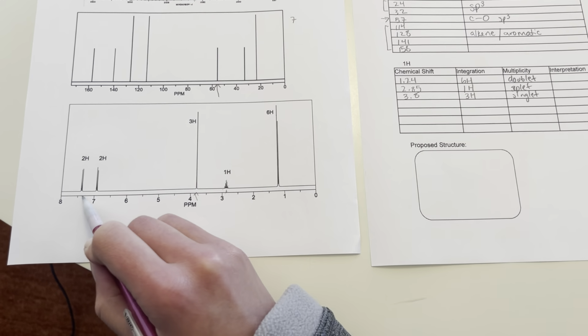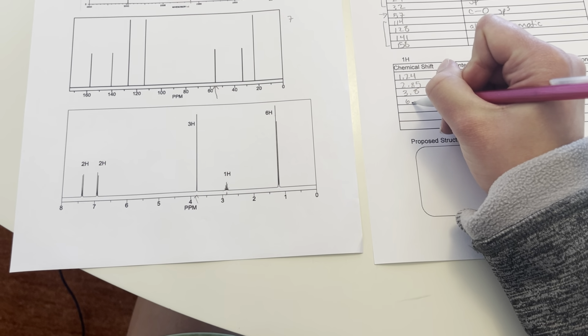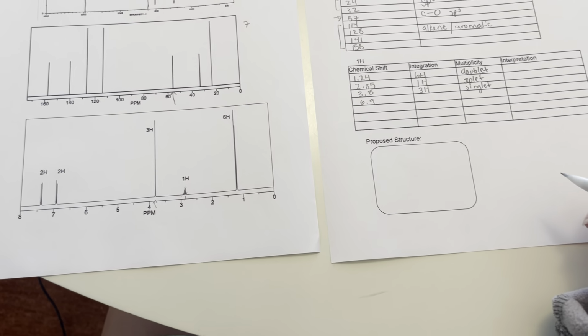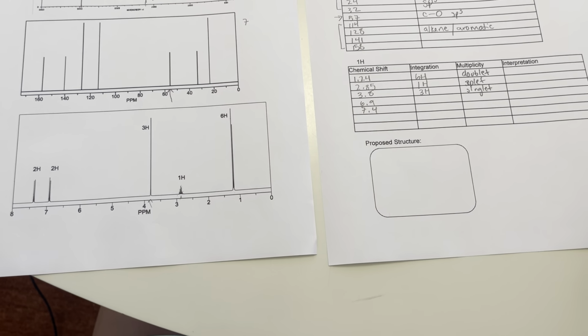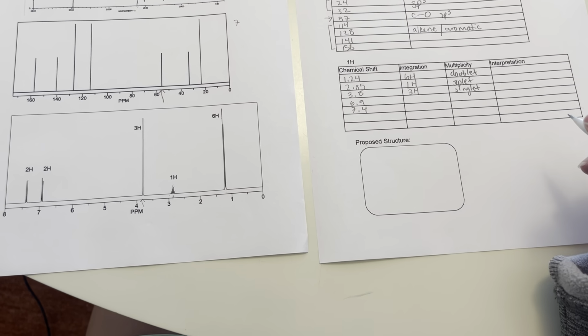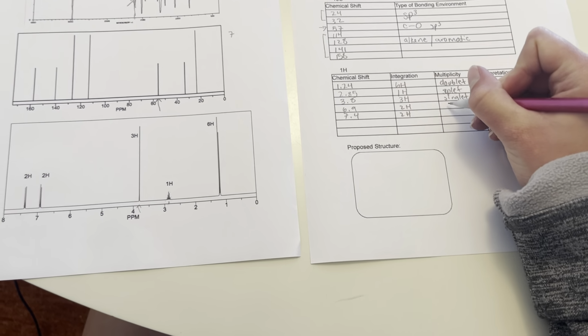And then these two over here are like 6.9 and maybe 7.4, and it looks like these are both 2H and both doublets.